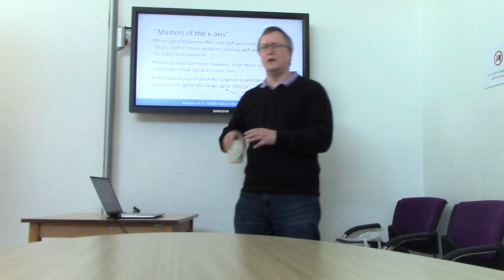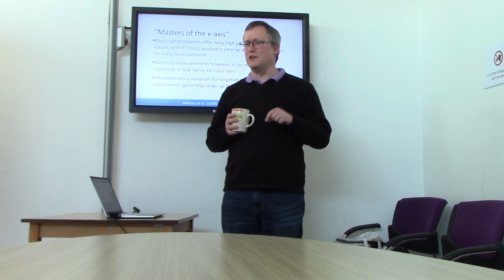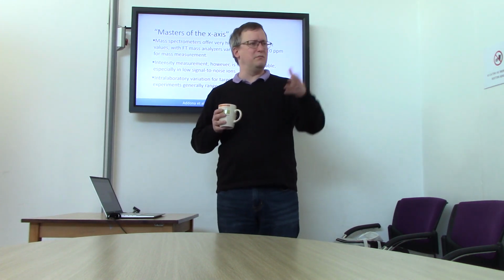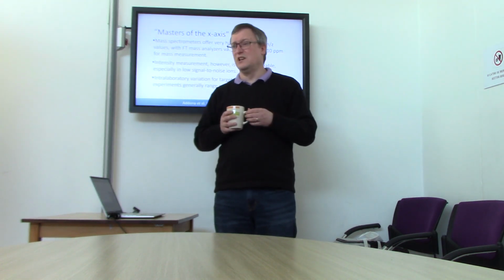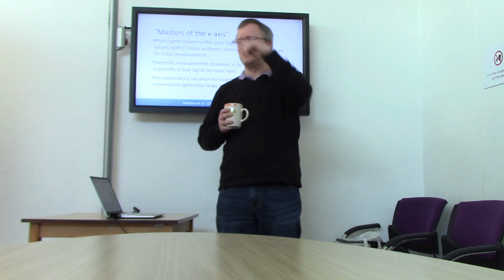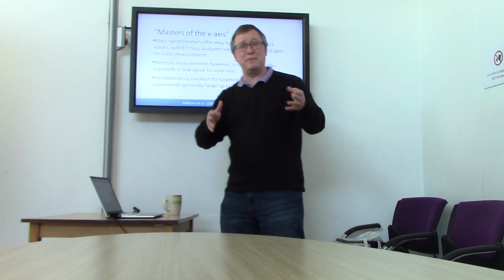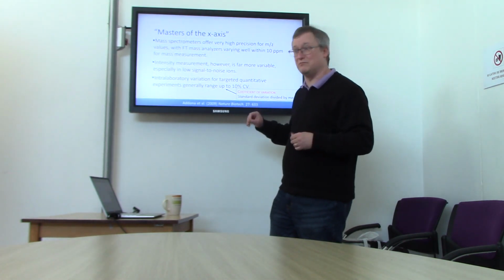So if I were to compute that for this classroom, I might write down everyone's height in centimeters. I would then compute the mean for it. I would compute our standard deviation, and I would ask, how big is the standard deviation compared to the mean? I don't know what the range of heights is here. It's what, 20 centimeters height difference? And if our actual heights are, say, 160, 20 versus 160 is a pretty small number, right? It's 1/8, so that's 12.5% CV. That's about what you have in the intensity variations that come from selected reaction monitoring experiments.